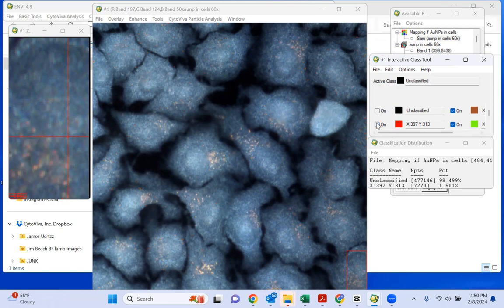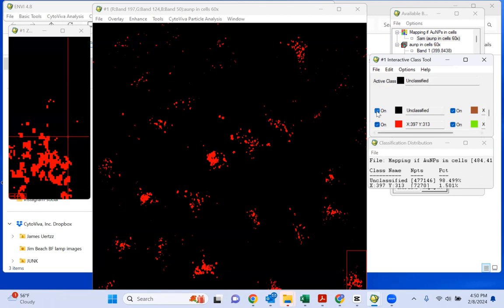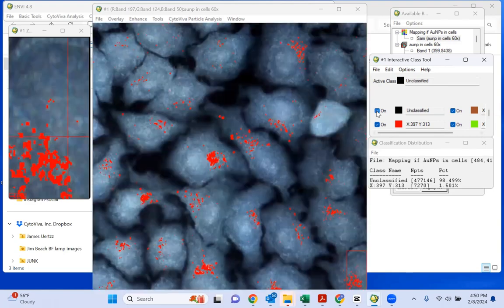So we can turn these off and on and see where they are in the image. We can also see where everything that was not classified as gold is in the image. And we have this kind of classification image right here. We can do this overlay that shows just where the gold is.